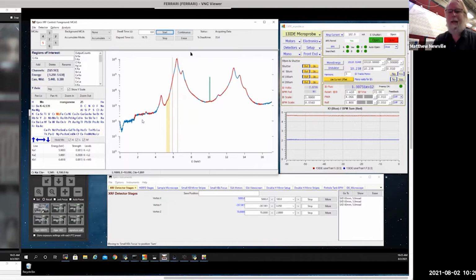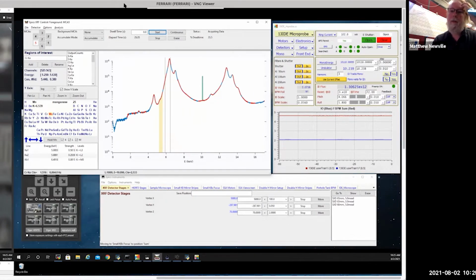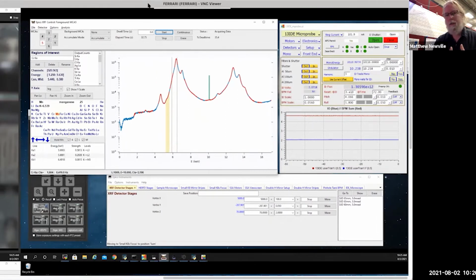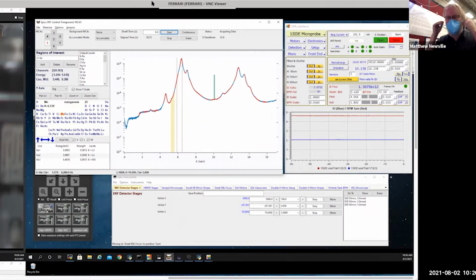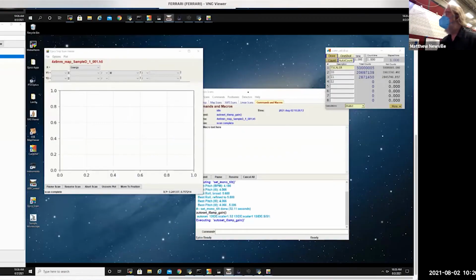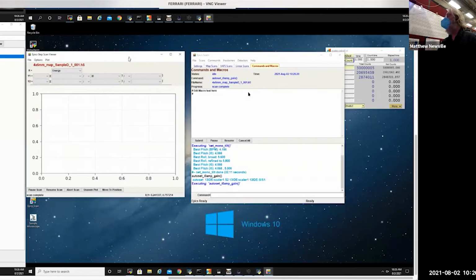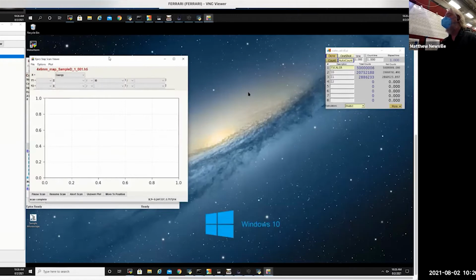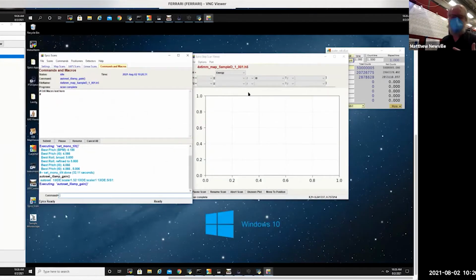Okay, so currently the X-ray energy is just above 10 keV. We have it at 10.1. So we want to move closer to the iron edge and then set up a scan to go across the iron edge, right? So to do that, we're going to use our data collection programs, which are down in the lower right portion of the screen. We have here a combination of GUI and a macro language, so that we can easily script. I'm just going to rearrange things over here, so that we can easily arrange complex data collection.